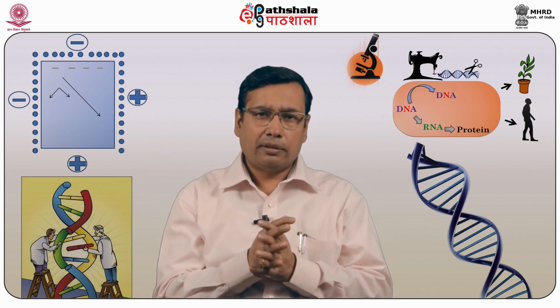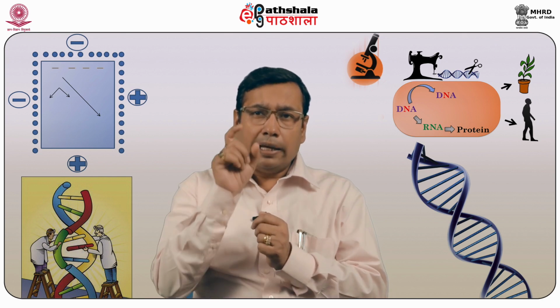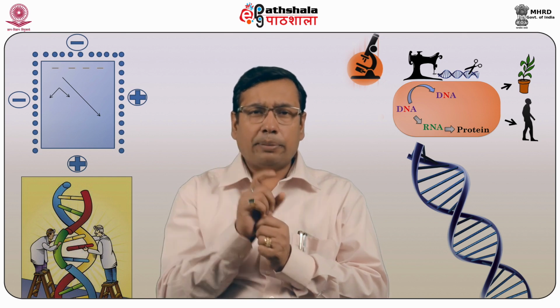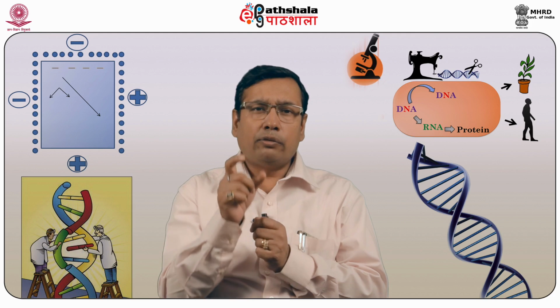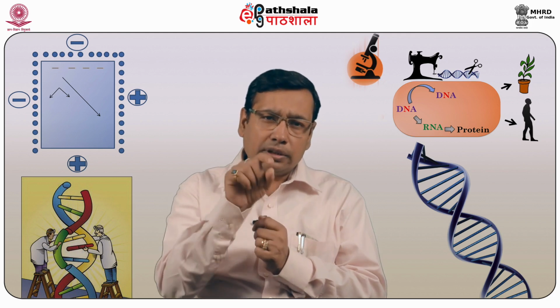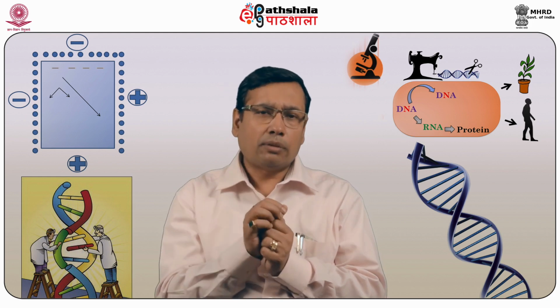and do the gradient PCR. By doing this, you can obtain a suitable range of melting temperature, that is the annealing temperature, where you will have the best PCR product, and then you can use that temperature for your future experiments with the same set of primers.